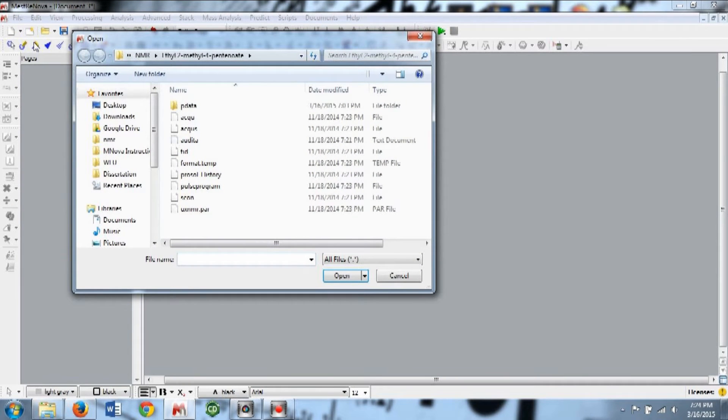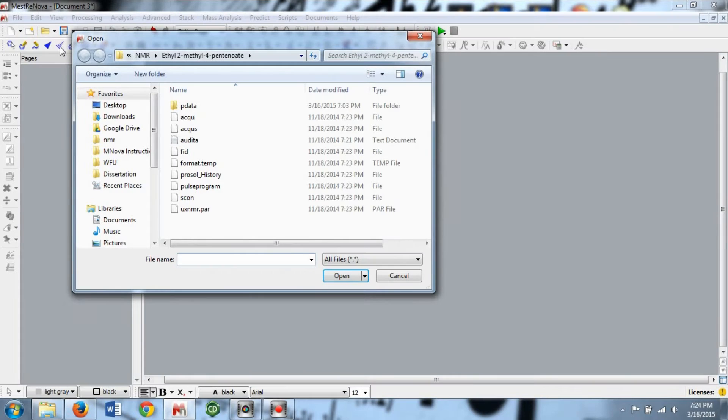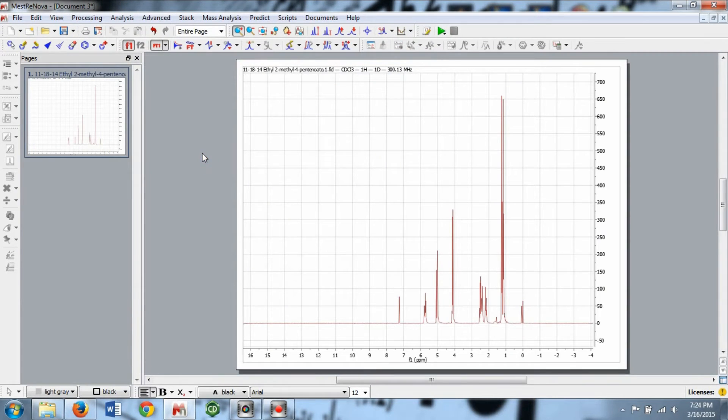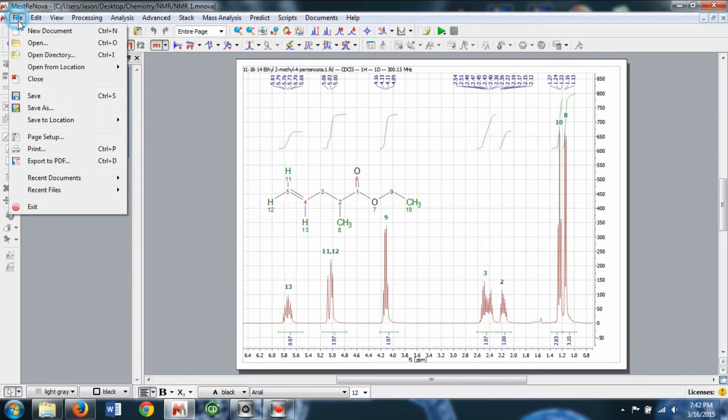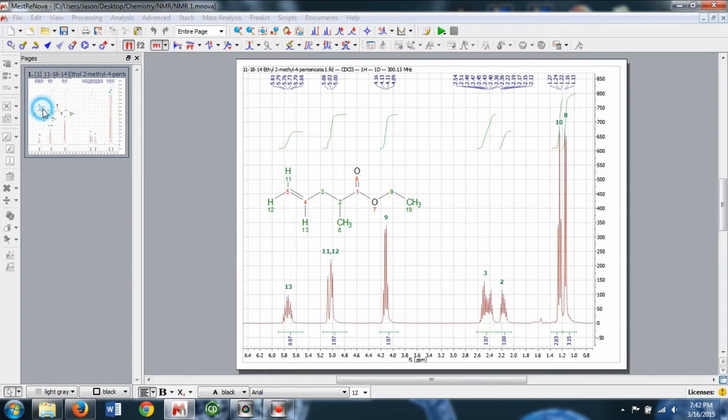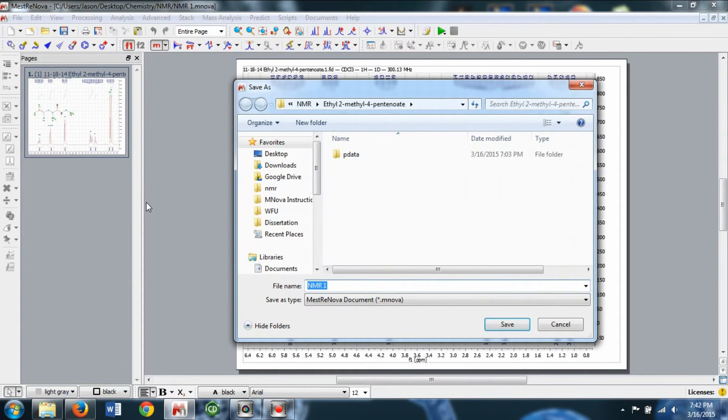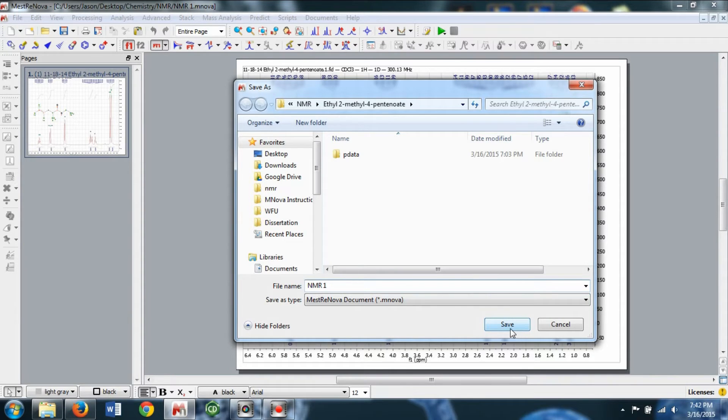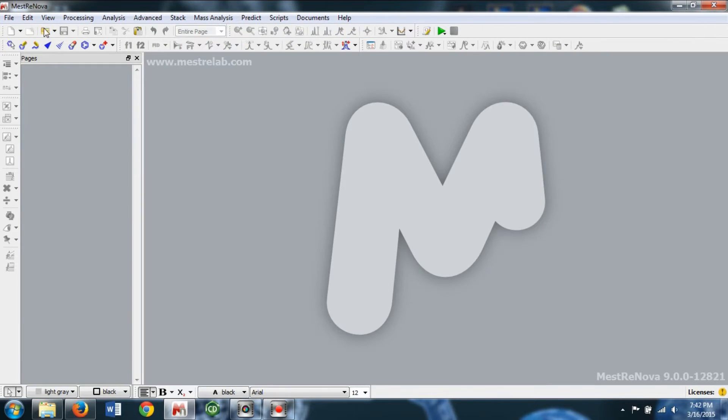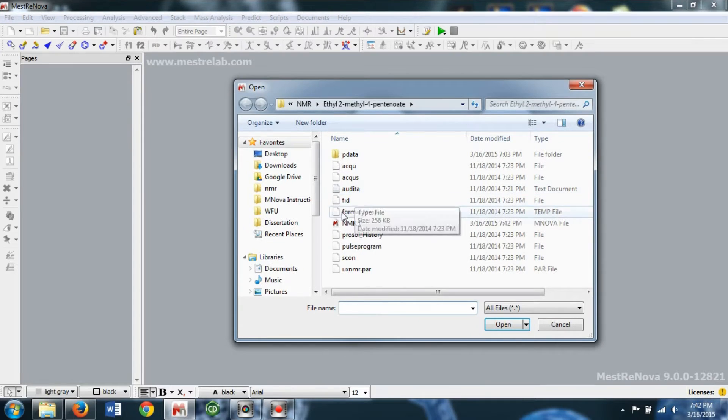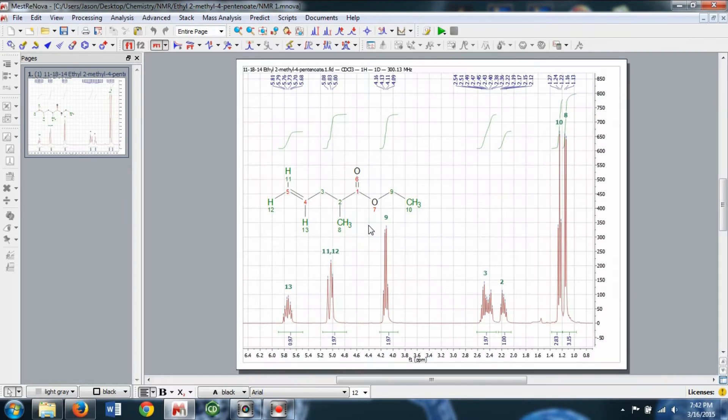Navigate to the folder where you saved your data. For NMR data, you'll either open the FID file or a .MNOVA file. If at any point you want to save your spectra and any analysis you've done, go to File and Save As to save your work as a .MNOVA file. This allows you to close the program and come back right where you left off.